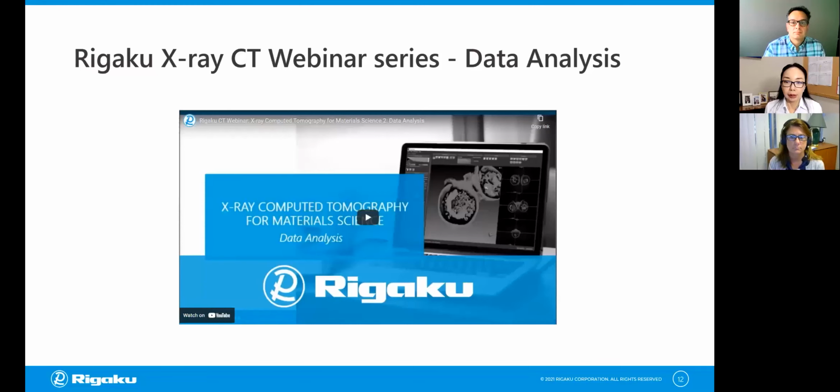So one is this, I'm going to call this a shortcut to learn what data analysis is for X-ray CT. This is one of the webinars we did 2 years ago, I think. There is an episode about CT data analysis. It's about a 1 hour webinar, but we go all the way from what a histogram is and what thresholding is and what all those morphology operations, smoothing are, and all the way to machine learning and deep learning, like everything squished into 1 hour. So if you're new to this, especially, you might find this one useful.